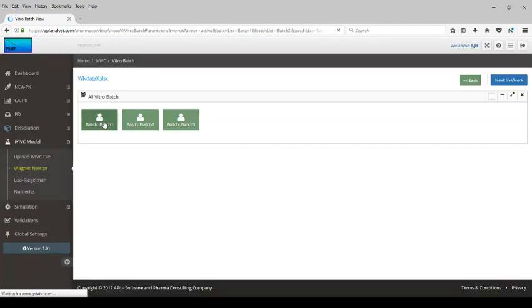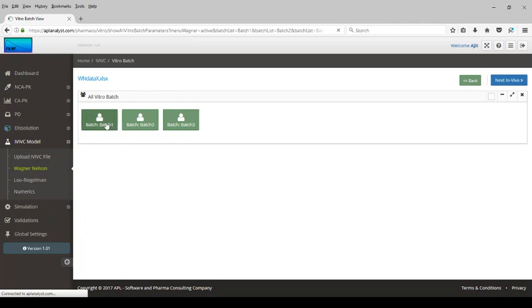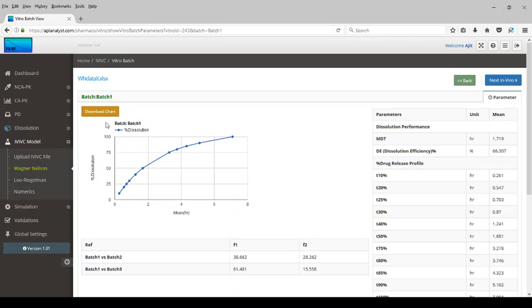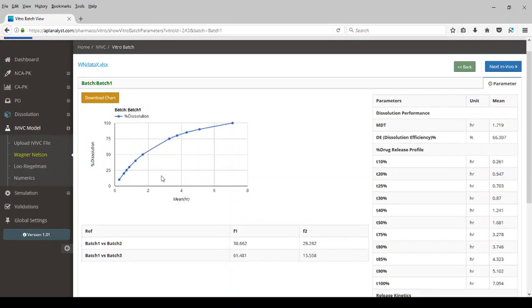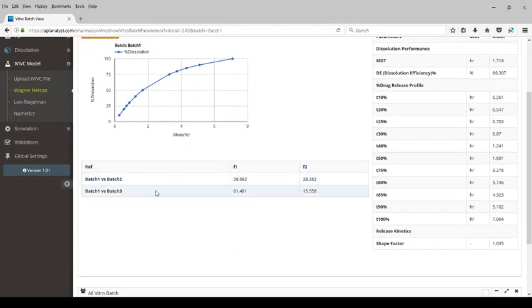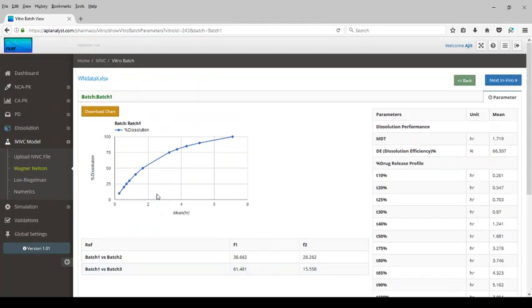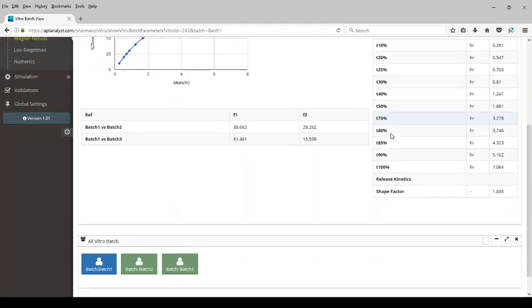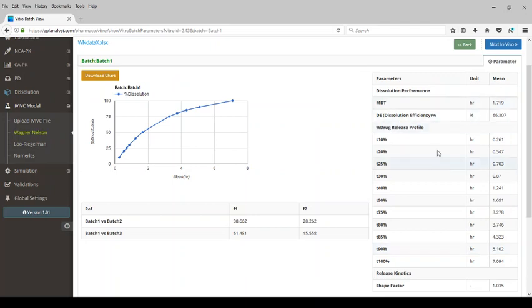Let's perform the in vitro analysis first. We have three batches. Let's look at the batch one analysis. Here the percent dissolution versus time is plotted. Then the F1 and F2 comparison for batch one versus batch two, and batch one versus batch three is shown. The other dissolution parameters are also computed here.